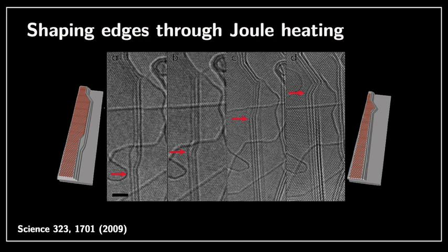And what was happening there is that Joule heating was applied. Joule heating is basically the idea of having a large current go through the structure, and that current would help reorganize the atoms. But it turns out that this could only happen under the microscope, in the sense that the additional energy from the electron beam was necessary to displace atoms. So there were a number of sputtering, migration, and other effects that made it such that the microscope could be used to controllably move atoms around. That was the first idea of sputtering in my personal scientific career that I was involved in.